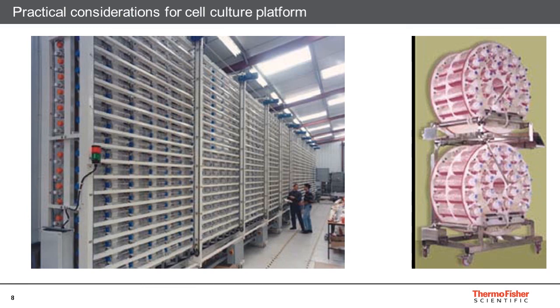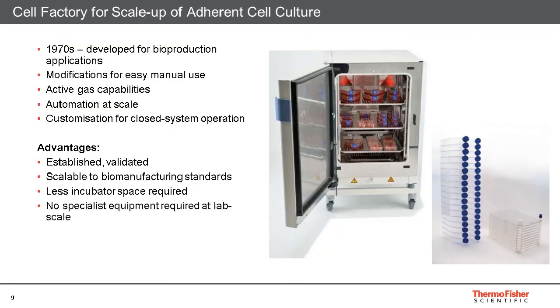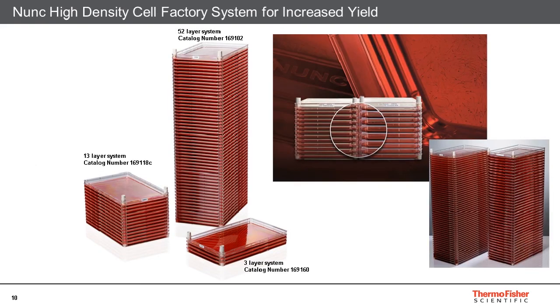Obviously, scaling that type of technology is a challenge. So here's an example of a large-scale installation. And of course, that has been the reason beyond those roller bottles and those flasks to come up with the more advanced technology of cell factory systems, which is also a very proven approach.